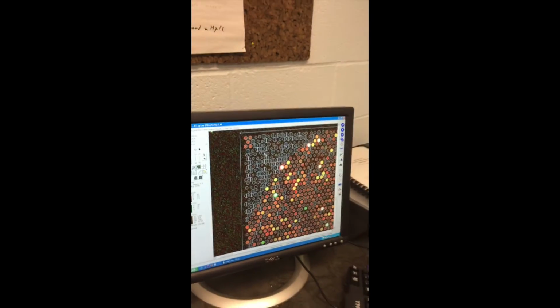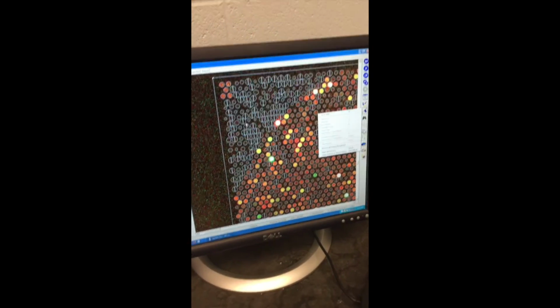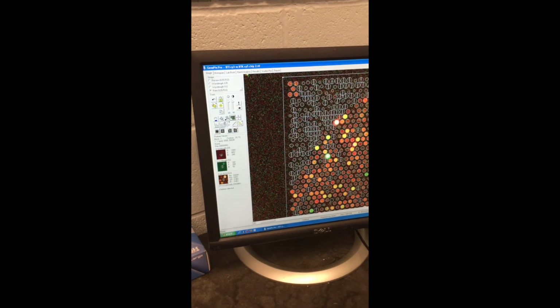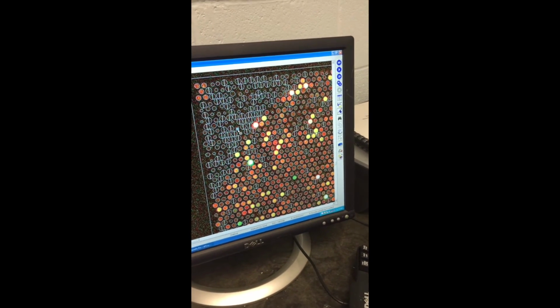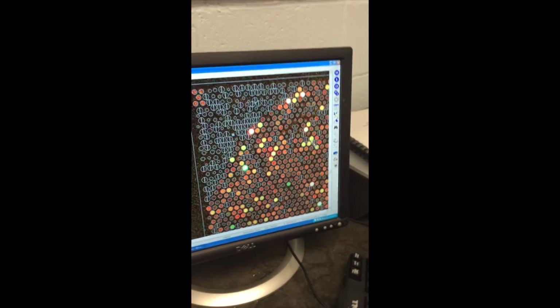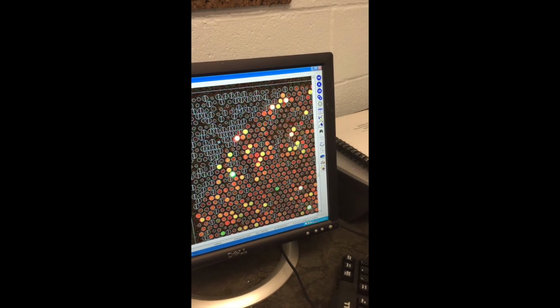Now you notice there's some spots that have a line through them. That's flagged data. So that's data that's considered by the computer to be non-existent. And you can actually go through, if you wanted to get real crazy about it, and flag even more data. I'm going to pick the right button for that. So I could actually flag that data and call it bad. See how I put a cross through it? Or let's say I went through and I said, oh wait a minute, this is really a good one. This should be considered. I could go back through and say flag good.